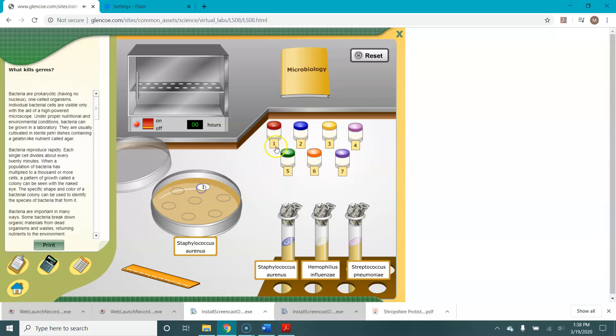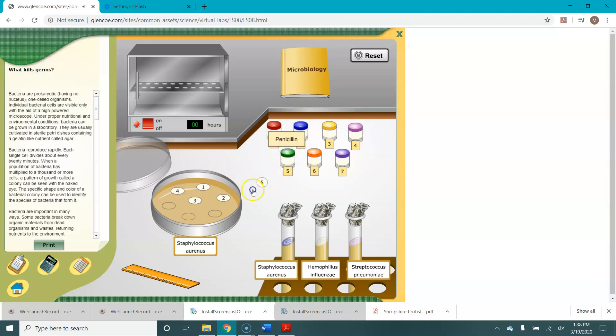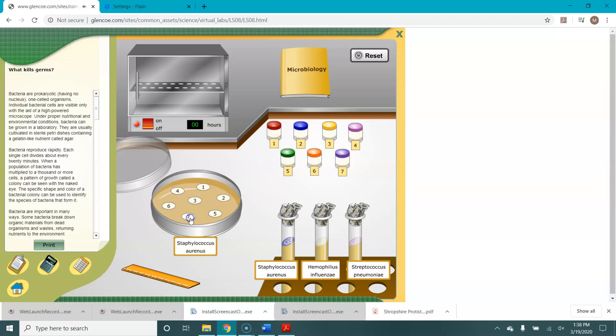Now I found that while clicking on things works pretty well in this lab, if you've got a touch screen the drag and drop does not seem to work as well on a touch screen. So just be aware that you may have to use a mouse or the touchpad for this instead of your touch screen. We've dragged and dropped all seven of our discs on there.